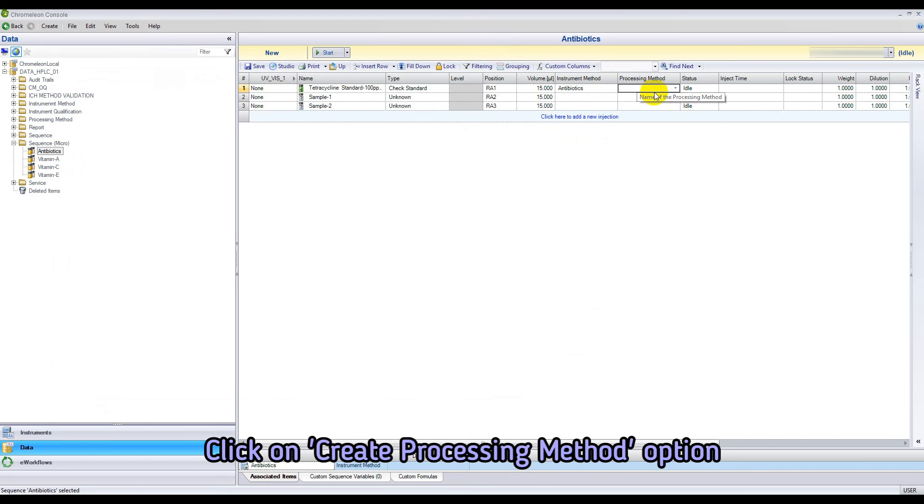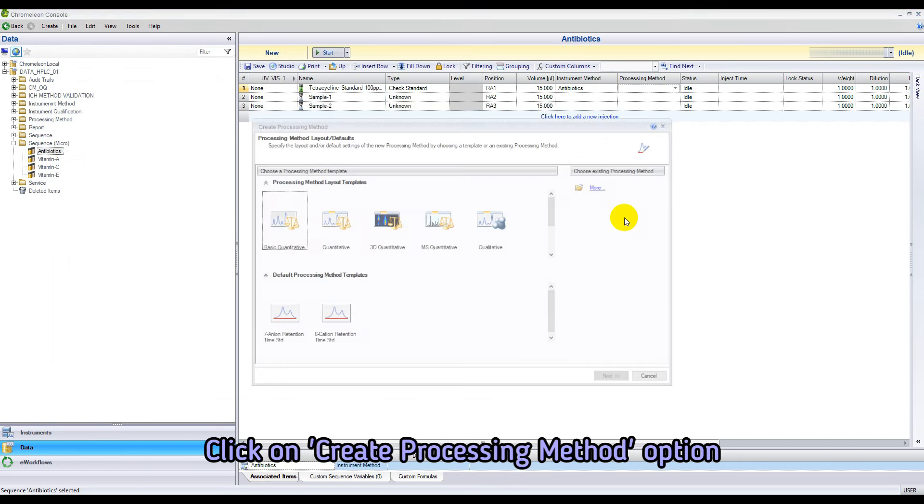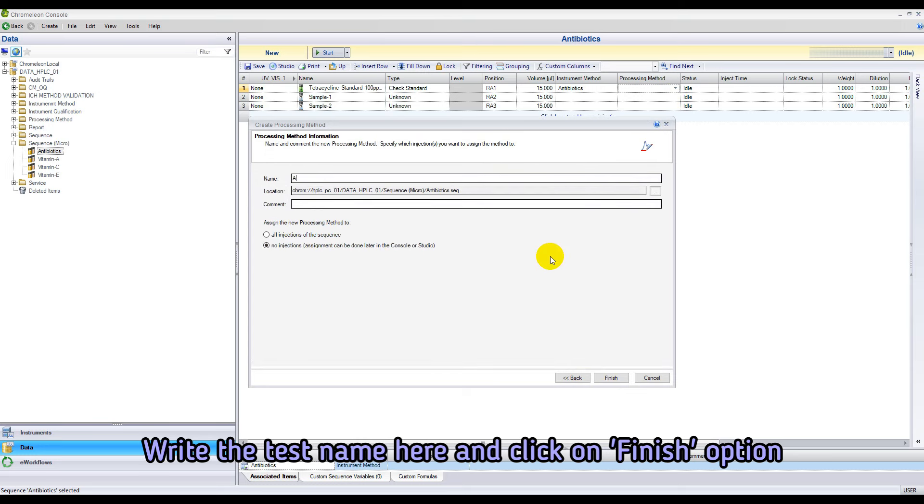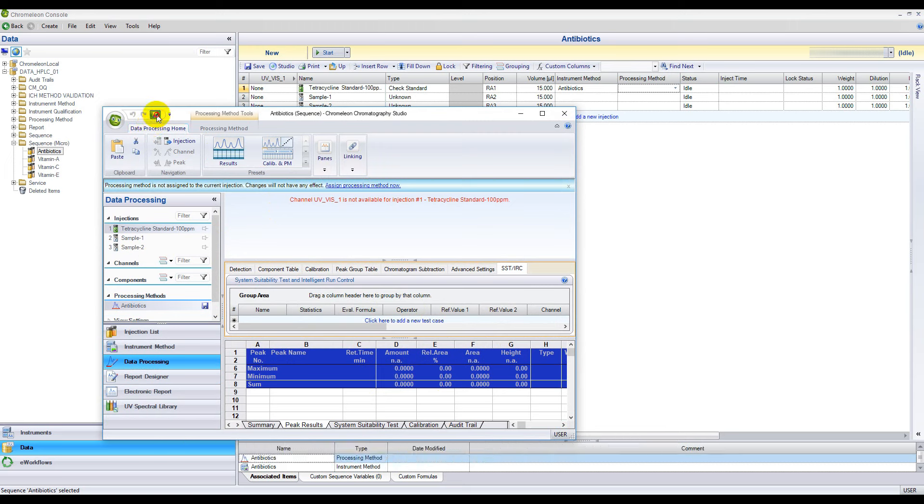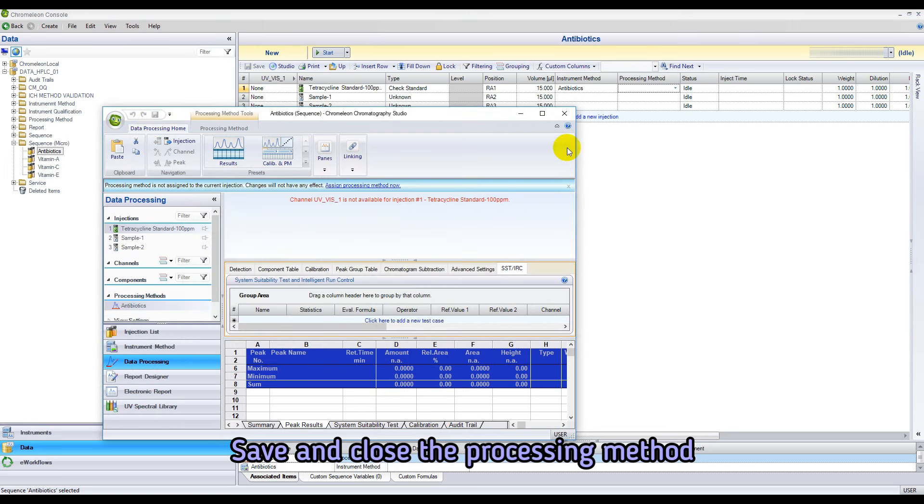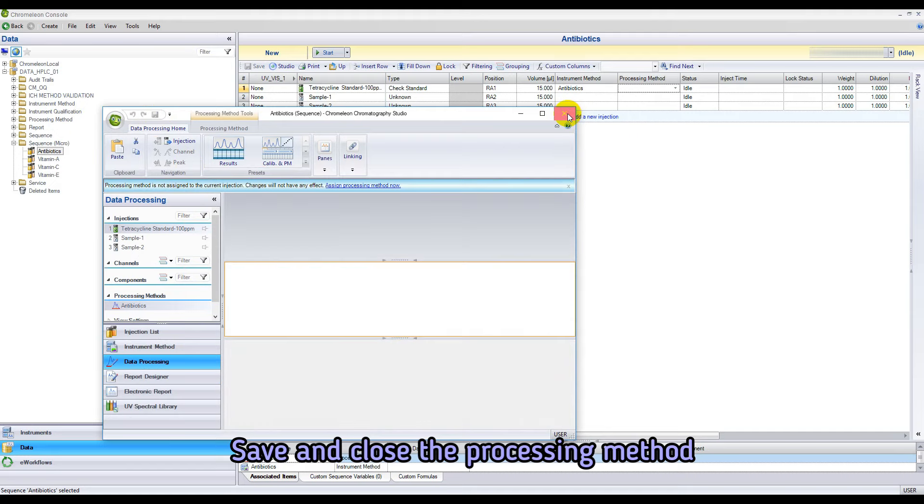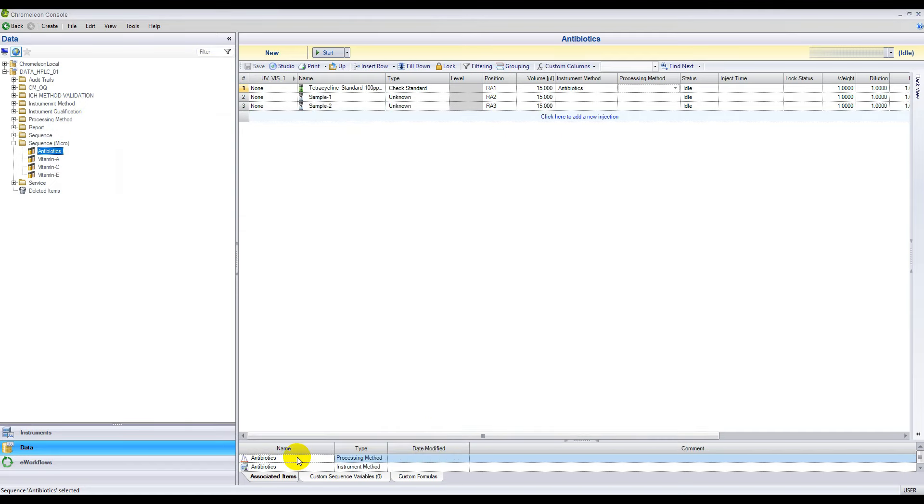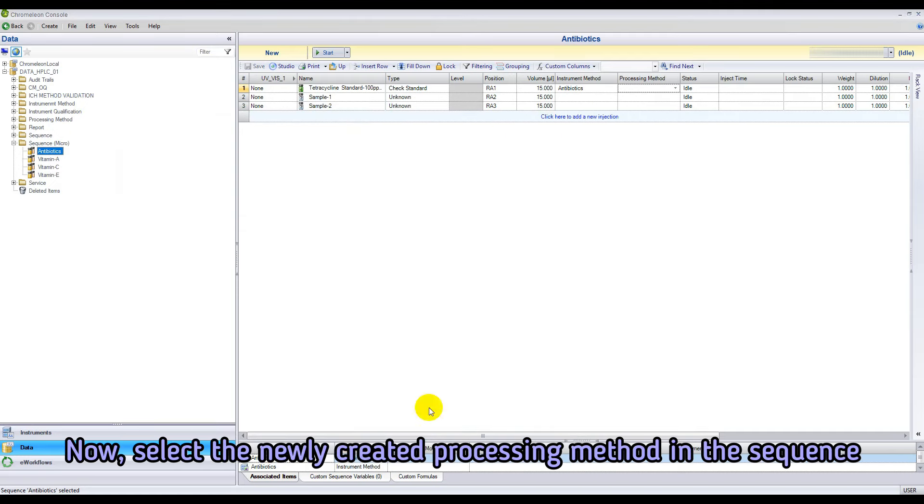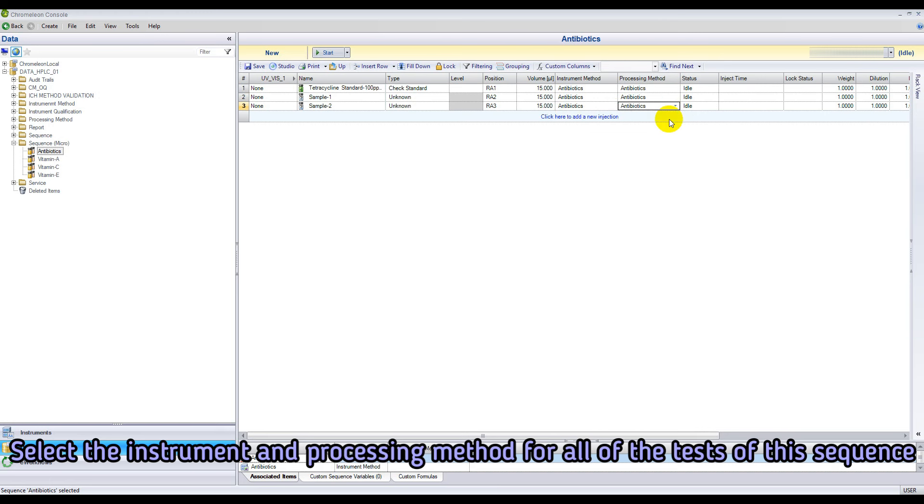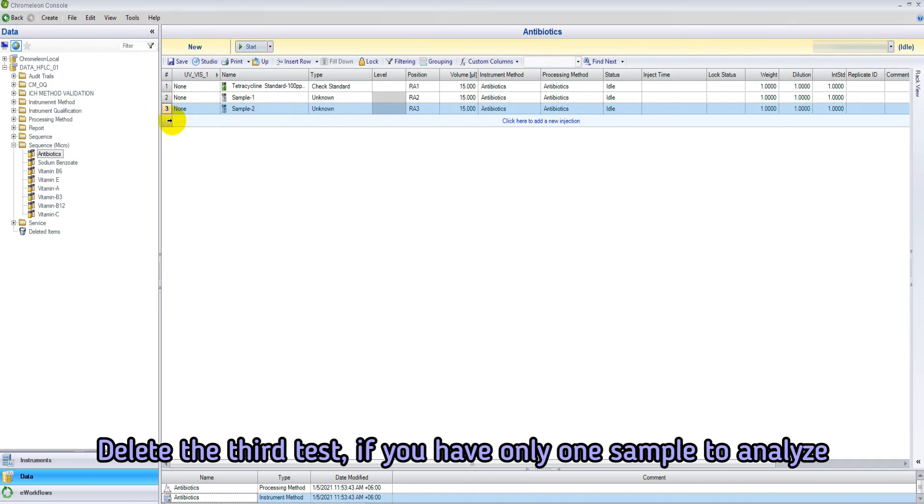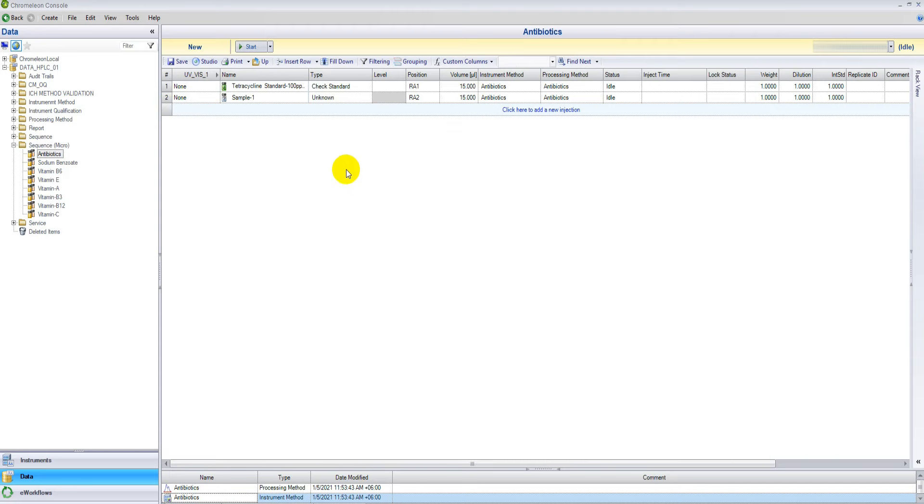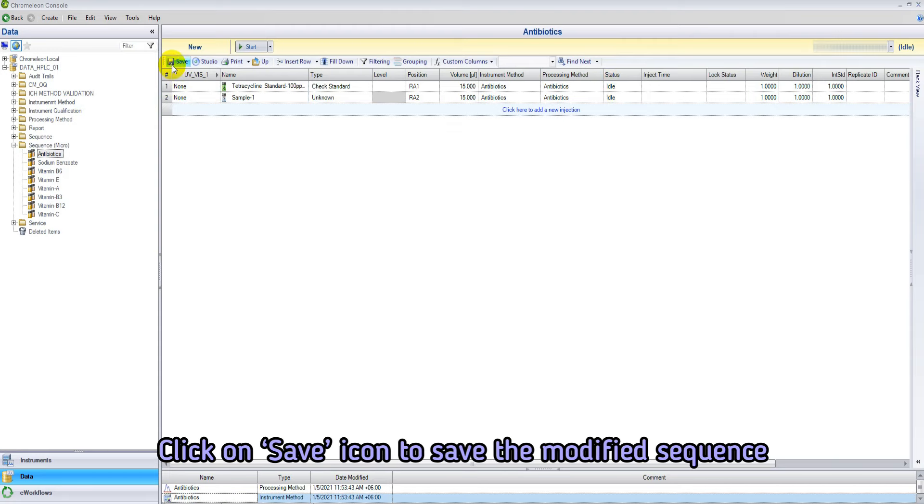Now select the newly created instrument method in the sequence. Now create a processing method. Select the newly created processing method in the sequence. Now select the instrument method and processing method for all the tests in the sequence. Delete the third test if you have only one sample to analyze. Keep the status idle. Save the sequence.